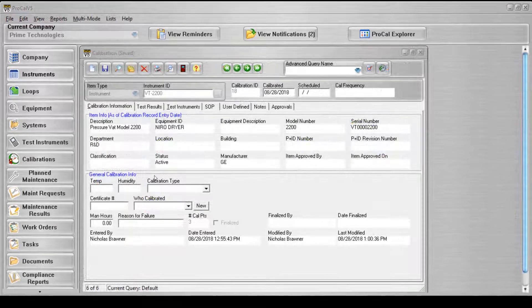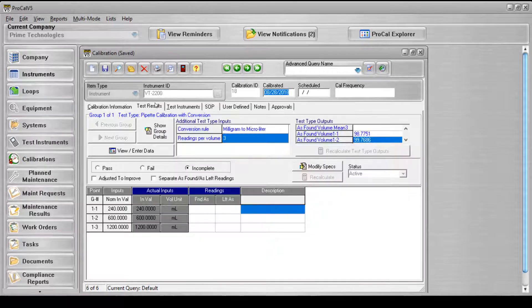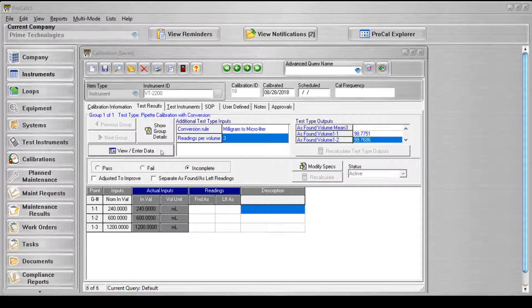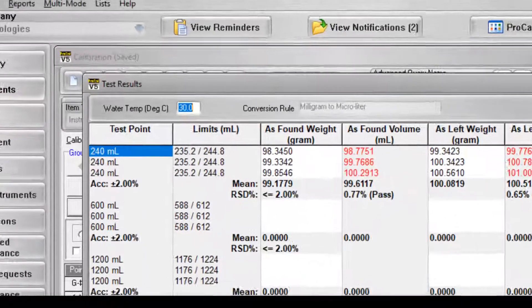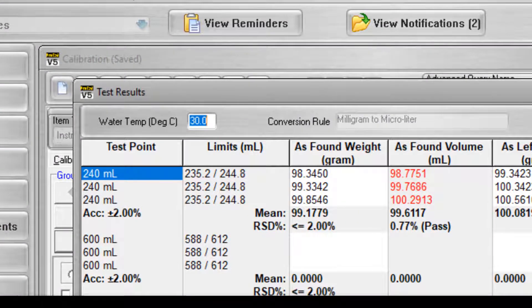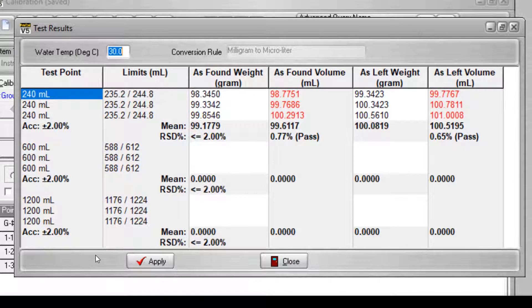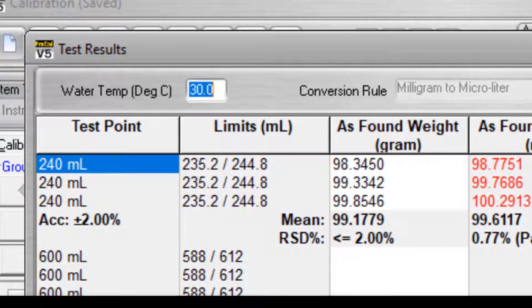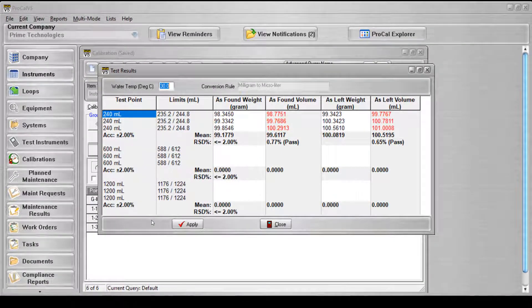After a calibration has been created for a record that uses the pipette with conversion test type, the calibration data can be entered on the test results tab. Data for the test points will be entered on the test results screen, which can be accessed by clicking the View Enter Data button on the left side of the screen. The screen will have a place for the user to enter the water temperature in degrees Celsius and a grid for entering the as found or as left weight. After the weight data has been entered for a given test point, the associated volume reading will be automatically calculated. The accuracy result will then be checked and out of tolerance readings will be changed to a red font color. The water temperature value must be entered in order to apply your changes to the current calibration record.